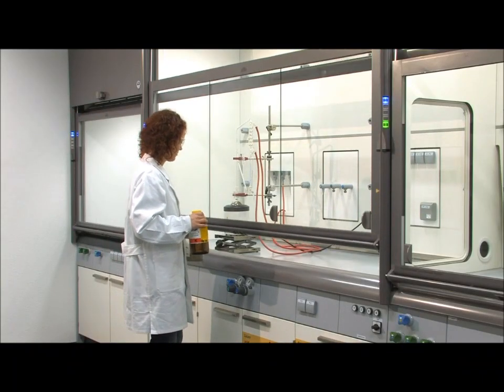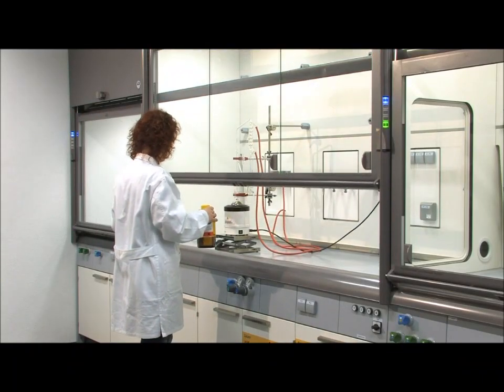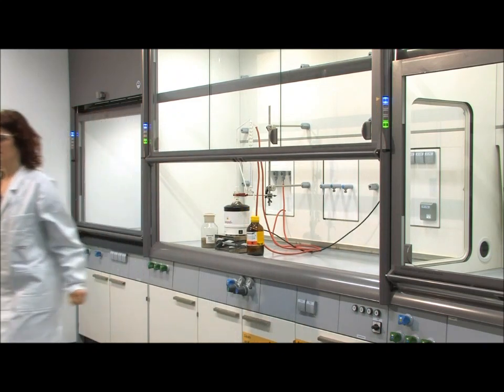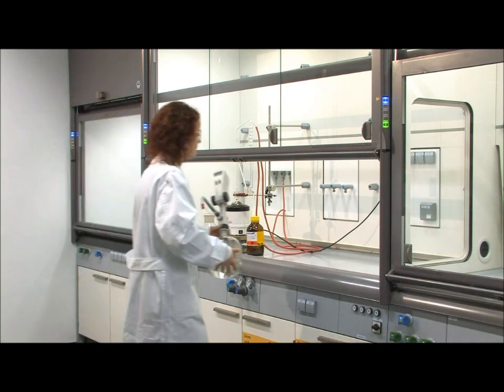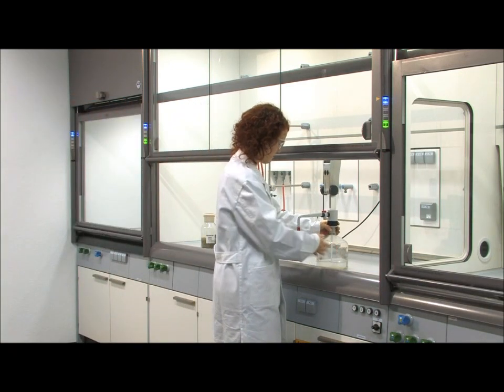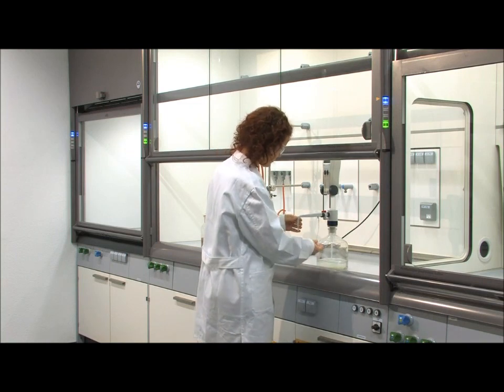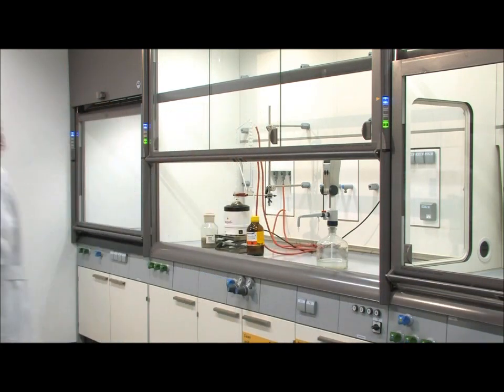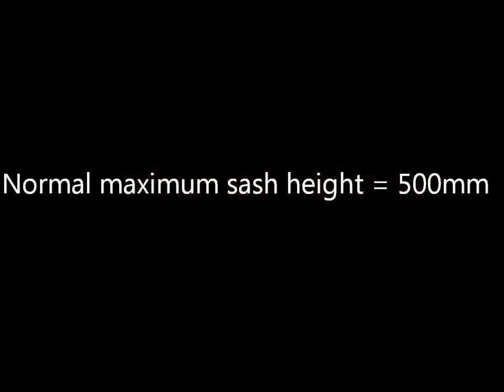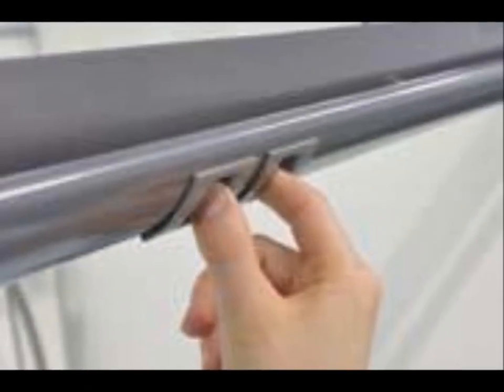Automatic Vertical Sash Operation. To operate the main glass door of the fume cupboard, which is called the vertical sash opening, simply push the sash gently up or down. The sash motor will then take over and drive to the fully open or closed position. The normal maximum opening height is 500mm, which is the point at which the vertical sash will stop against the rubber stopper. This opening height can be increased to 900mm temporarily for accessing or installing large equipment in the work area.